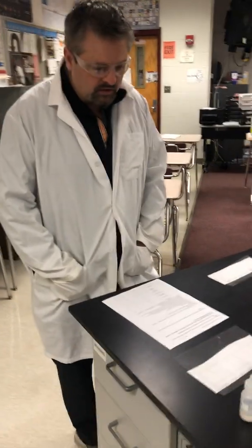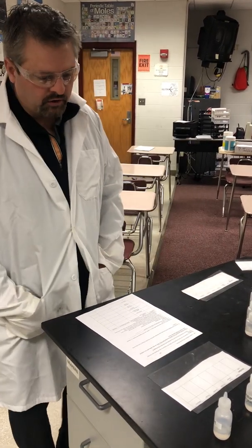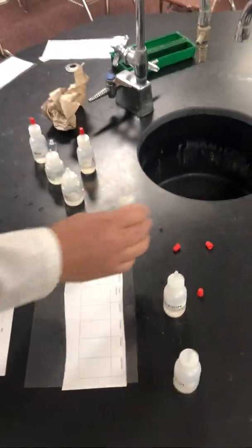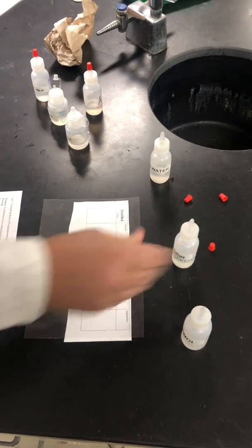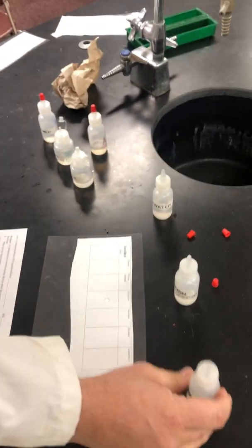All right, so we're going to do the timing of the evaporation rate. So the idea here is the longer it takes to evaporate, would you think the stronger or the weaker the force is? All right, stronger. So here we go. So I'm going to go ahead and do distilled water, 1 drop, glycerin, 1 drop, and where's ethanol? Ooh, 1 drop.